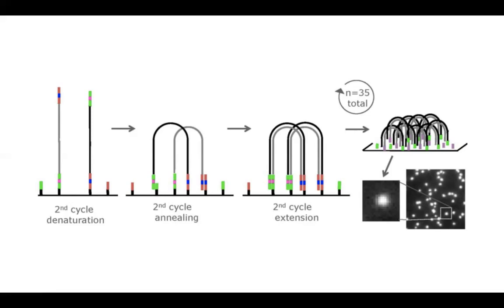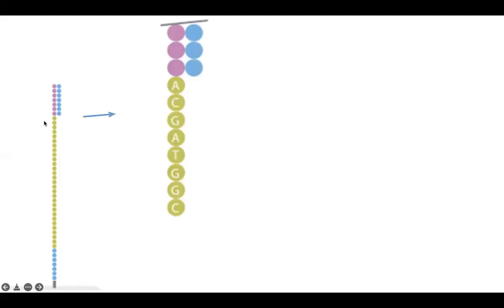So next we get to the sequencing itself. So we have this DNA molecule again bound to the flow cell with the adapters, in this case indicated in pink and blue. And then if we zoom in, the sequencing primer is added, which is just a simple primer that fits to one of the adapters. So it binds to the adapters, just flanking the cDNA fragments.